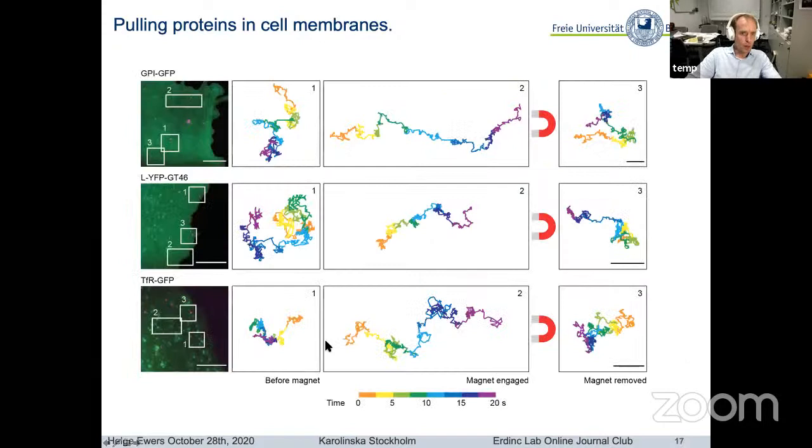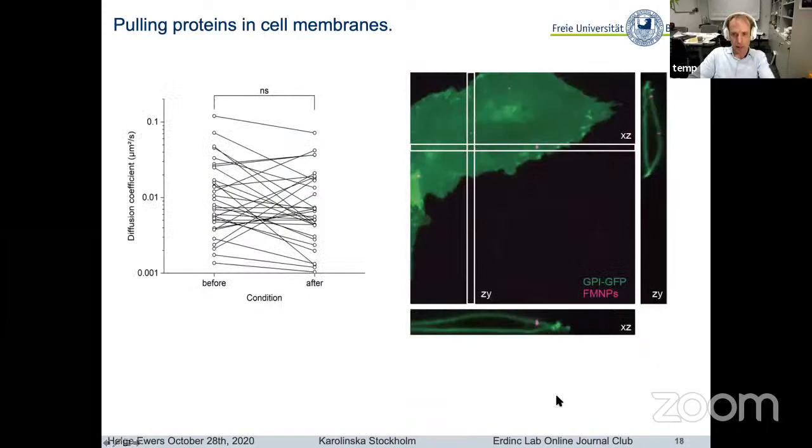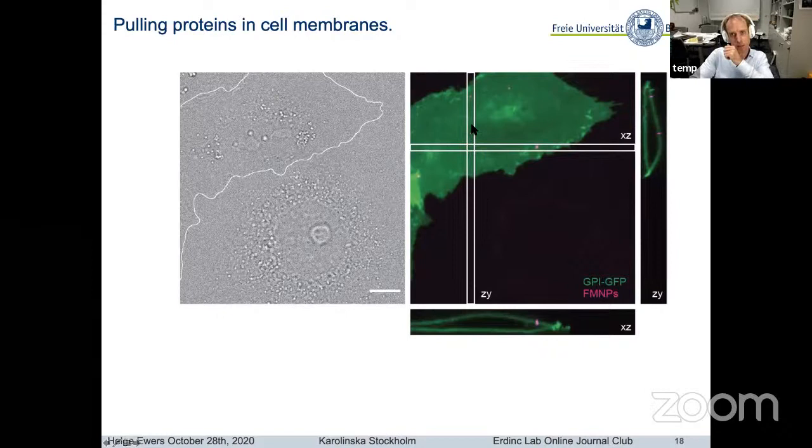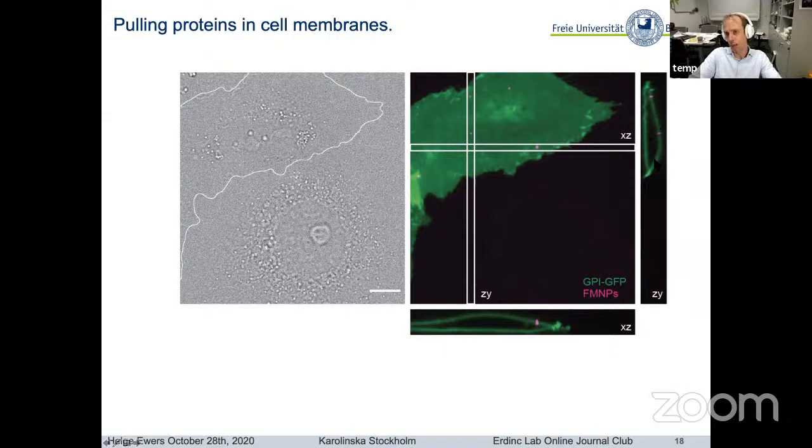No matter what protein we used, all of them—GPI-GFP, L-YFP-GT46, or transferrin receptor GFP—they would exhibit random motion before we tracked them. When we approached the sample with a magnet, they would move into the direction of the magnet, and then when we removed the magnet, they would resume random motion in the plane of the membrane. We could show that this was specific binding. Here you can see this is a transfected cell, this is a neighboring untransfected cell. You can see that these particles only bind to the transfected cell. Using confocal microscopy, we can see that they are nicely on top of the cell, and don't bind to the coverslip or anything.